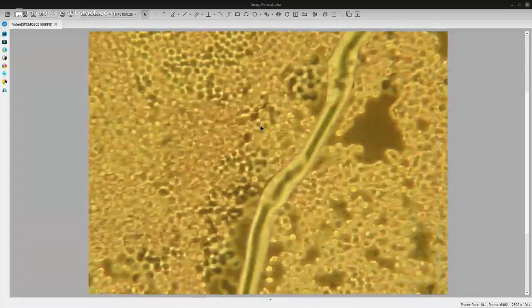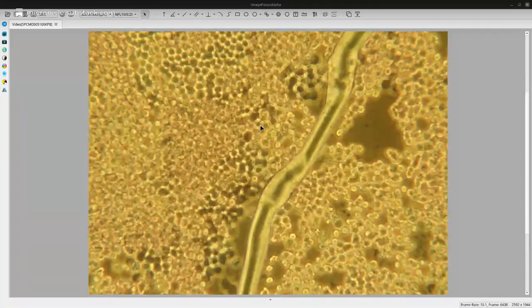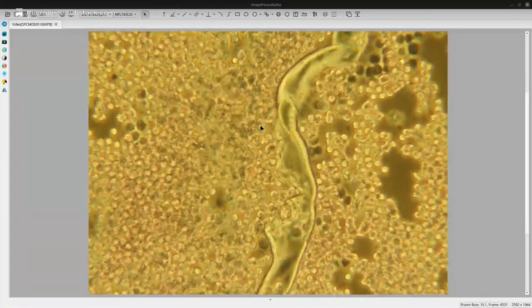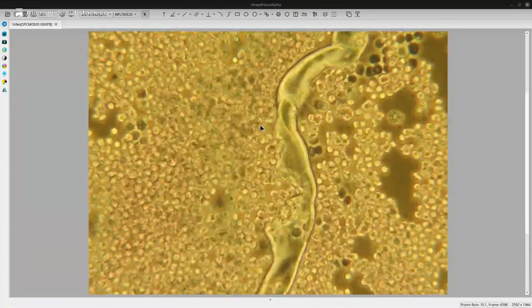And up here it gets a bit wobbly and changes in thickness up to this end, which is really quite different. Looks almost broken.